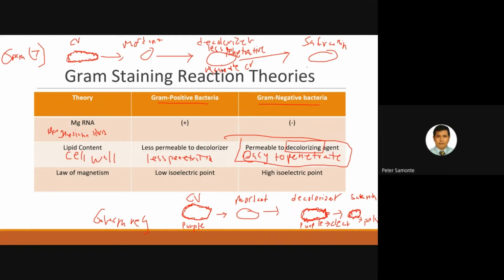Yes, Ralph. The color now then, sir, will become pink to red, sir. No, this is gram positive. This is gram positive, Ralph. So remember, in gram positive, the final appearance of your bacteria would be purple. So what would happen if you add safranin here?